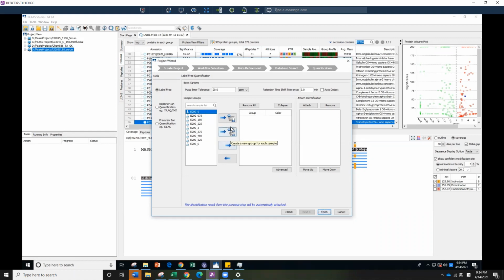So the same things here. If you want to group them into different groups, select one folder. You can name it, okay, condition 1, and there will be your replicate samples. Something like that. So there's your condition 1 and condition 2. But for our folding projects, they are all independent.